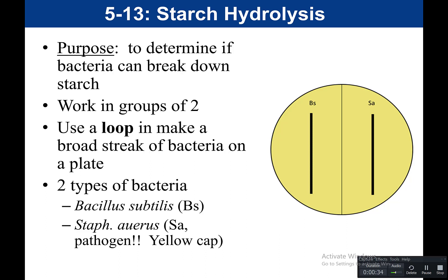This experiment would normally be done in pairs. You would get one starch agar plate — this plate has starch in it. You would draw a line down the middle and label one side BS, which is going to get Bacillus subtilis.